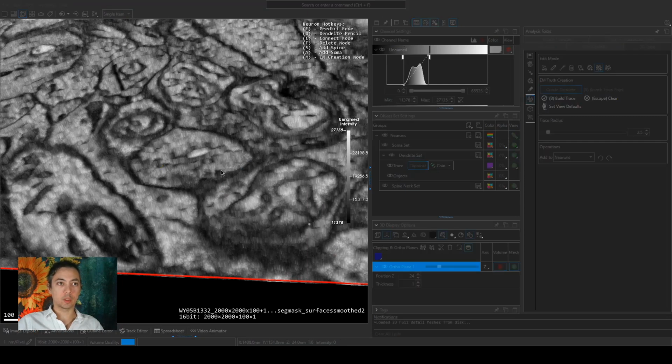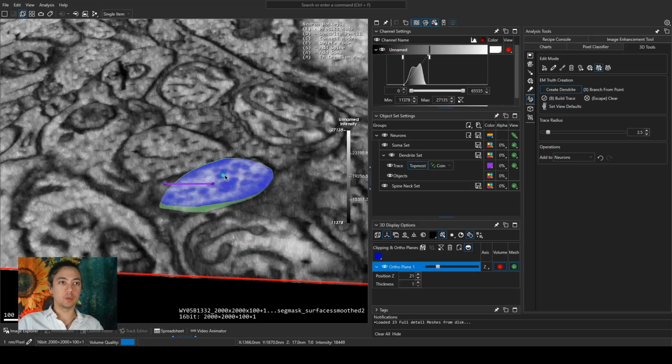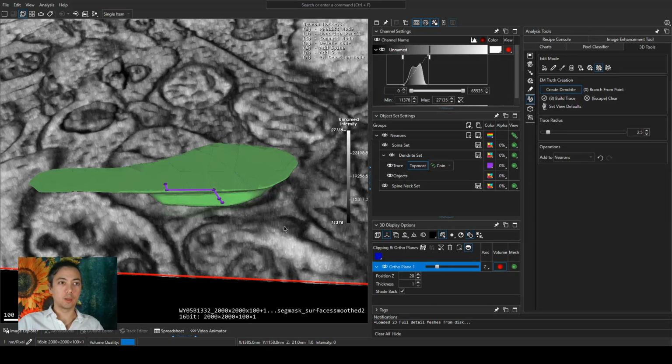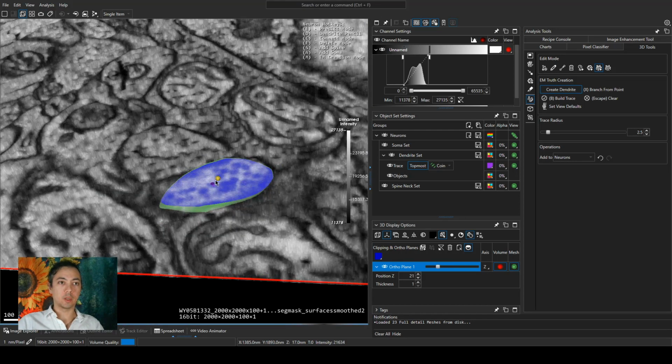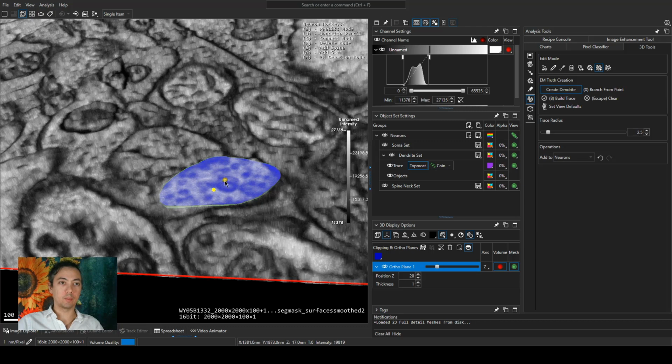Okay, complete that. So now what we'll do is we'll actually get rid of these other points, which are kind of silly. And we'll just use delete, snip off this one, and then we'll go back to editing and do this. So now we can branch from this one again and go up.